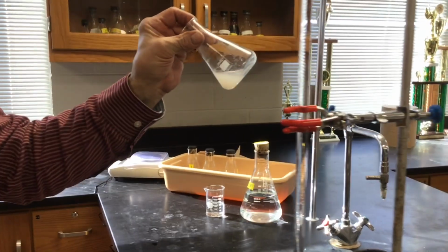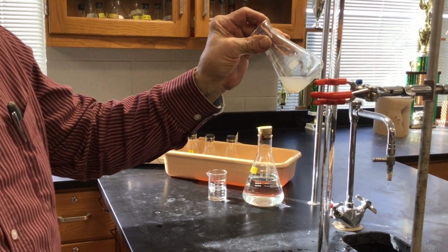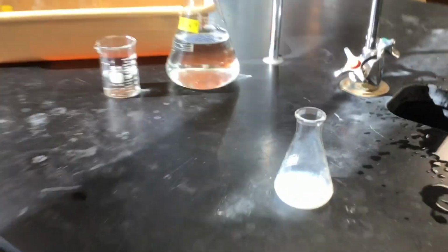Does it look more brown than it was? I would say, let's go for it. I think that's brown enough to call that brown. This is a tough endpoint.